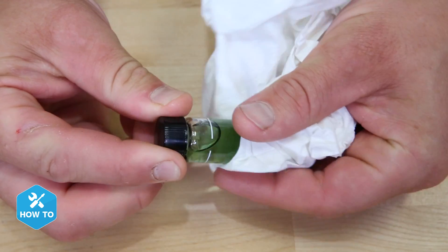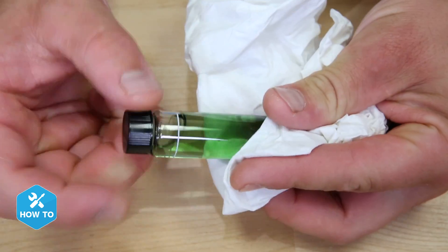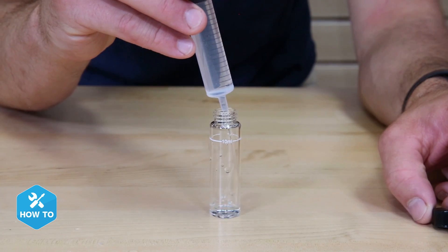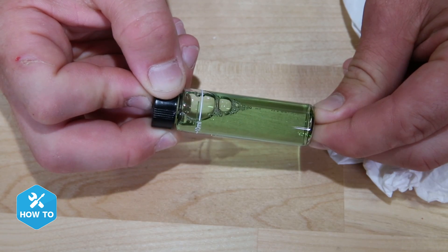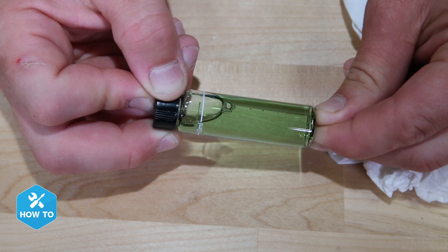A couple of things to add here. It's very important that the testing cuvette be free and clear from any dirt, debris, oils, or fingerprints for accurate results. This is why I like to clean my cuvette with RODI water before testing and using a separate syringe to fill it. Also, bubbles or debris in the water sample can throw off a reading, so be sure to tap any bubbles away if there are some.